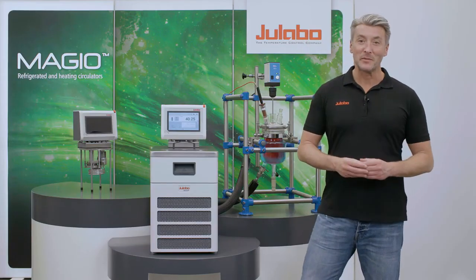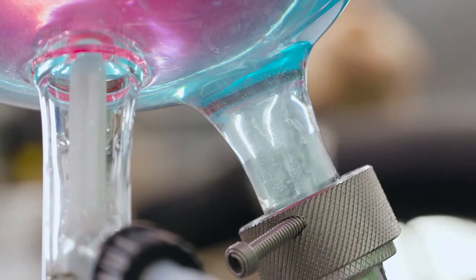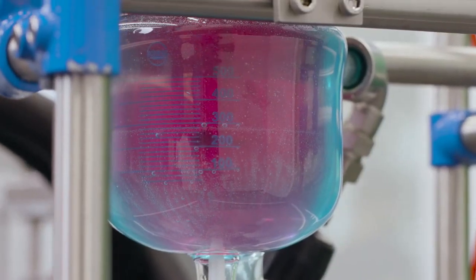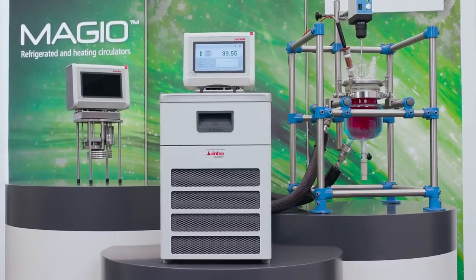Please make sure to keep the liquid level of the bath tank constant and add fluid evenly as soon as necessary. The air will automatically be expelled while filling the system. If the liquid level remains constant, wait a few more seconds before stopping the process. This way, we can ensure that the whole system is degassed.